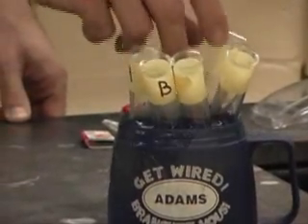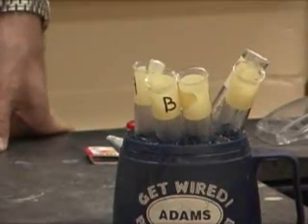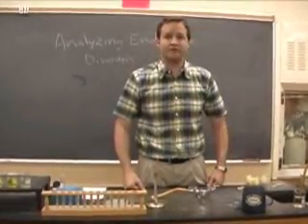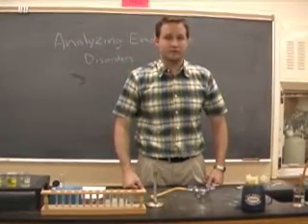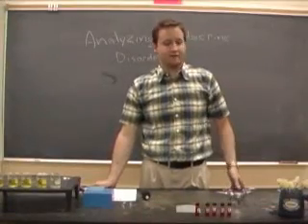We're going to flow hot water in there. That's okay. And we're going to let them sit for a little while. And in about 5 minutes, we are going to take a look at the results and see which one indicates glucose in the urine.